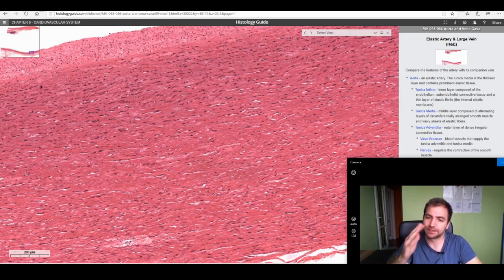So again, the structure as we see it right here is interspersed with the lamella, also called elastic lamellae, because of the presence of the repeated structure in a specific sequence over and over again. And here we're going to find the elastic fibers along with the smooth muscles. The unique feature is that, instead of fibroblasts, the cells that produce the elastic fiber are the smooth muscle cells.